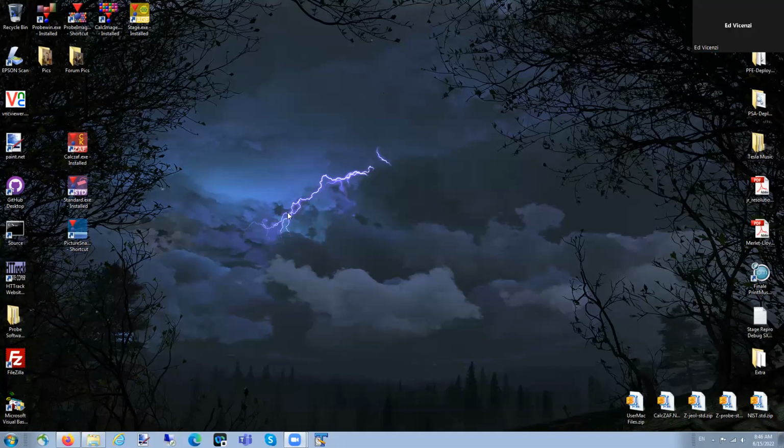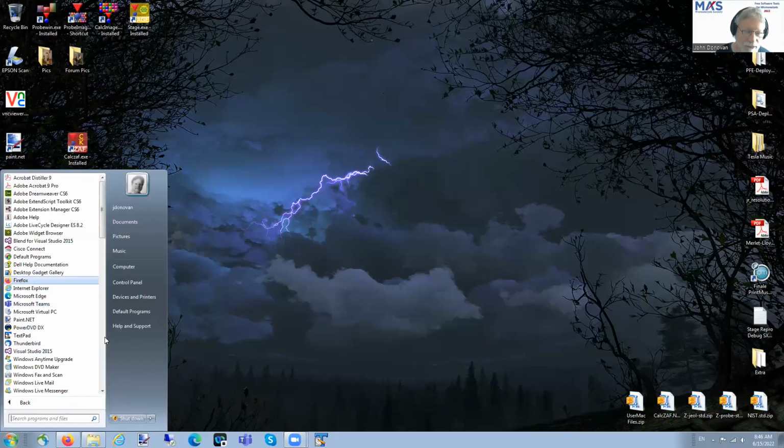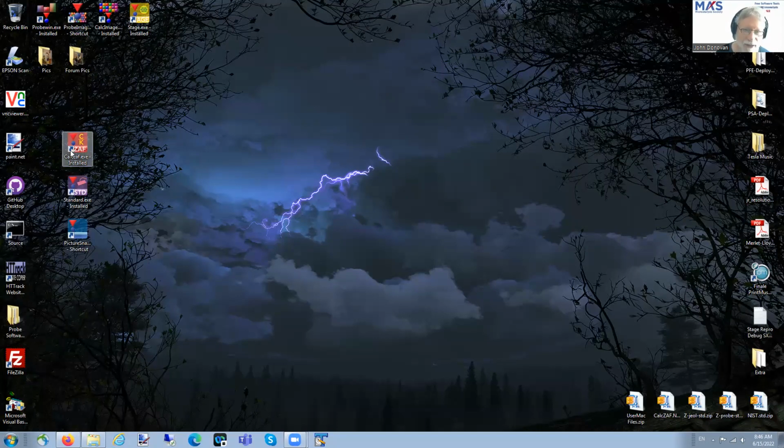Great. So I'm going to talk about 3 programs today, 2 right now, CalcZAF and Standard, and these are them here. If you download the CalcZAF.msi, which stands for Microsoft Installer, you get a menu that you can browse to, here, and then you'll have CalcZAF and Standard, and then PictureSnapApp if you install that. But you can also just put a shortcut on the desktop. So I'm going to just start from here.